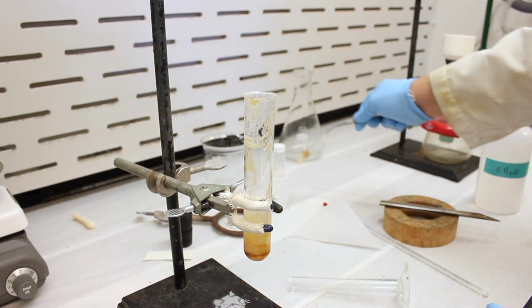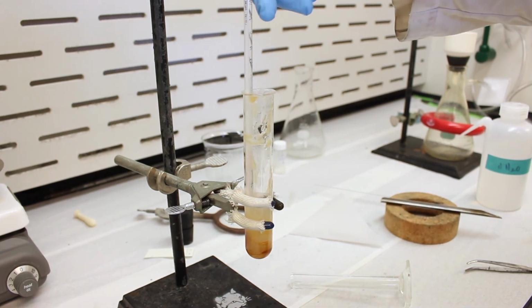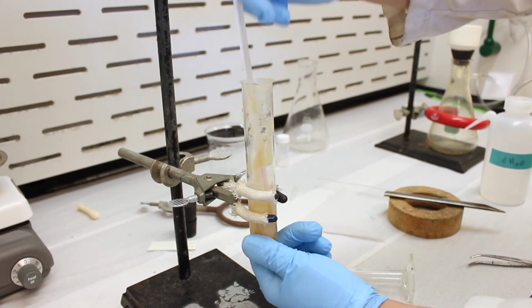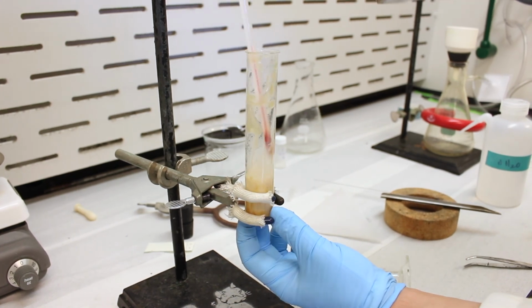Okay, we'll also set this aside. And we'll just use a thermometer. I'll be careful here. Try to stir this up. So we have a very viscous goo here, but you can see the product precipitating. It's a white solid.